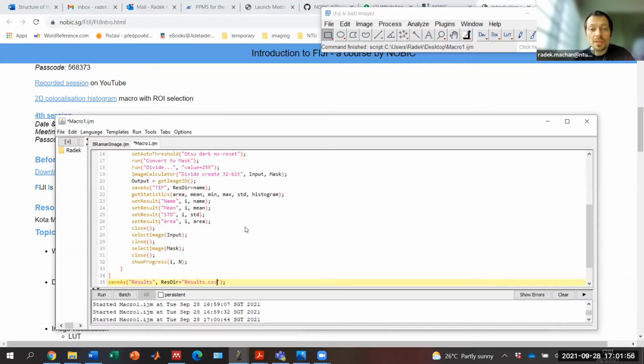For example, there might be cases where it's difficult to automatically segment the right features, so that it might be segmenting features which don't belong there. And by thresholding, we can't distinguish what belongs there. It needs the input from the user who knows what the features of interest should be. Of course, in principle, it can be automated. We can, for example, train a neural network to recognize what are the features of interest, but let's be realistic. So let's say we need the input from the user.